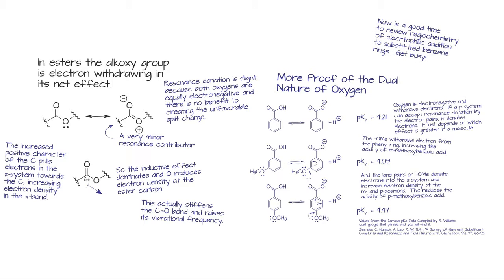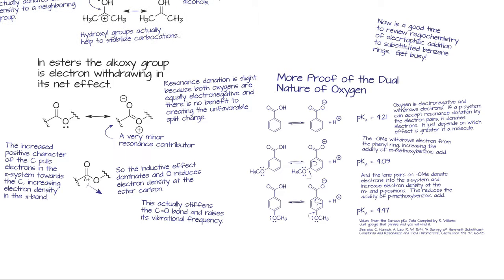So we'll see a lot more of this. You'll see a lot more of this concept in advanced organic chemistry and physical organic chemistry later on. But you might want to also investigate a review of organic chemistry of how the methoxy group is an ortho-para director in electrophilic addition to benzene rings. And that has a lot to do with this electron donating character as well. So you'll review all of this concept if you review your organic chemistry about electrophilic addition to benzene rings.